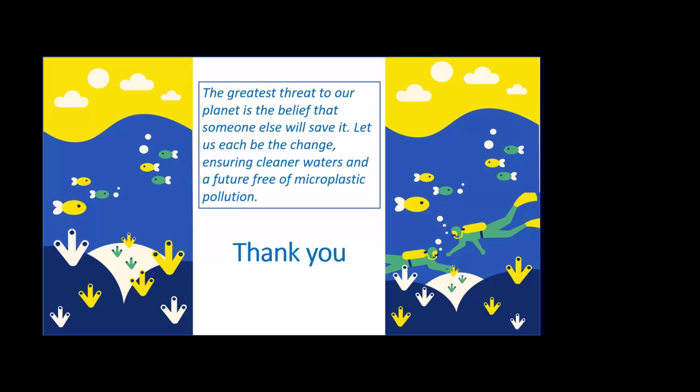I have actually gone through some research papers regarding this microplastic. Several research papers are there, like adsorption onto biochar. Based on those methods, they are using specific types of microplastics, and their method is using some kind of methods like UV spectroscopy. So is it possible to use that UV spectroscopy in the analysis of a specific type of microplastic?